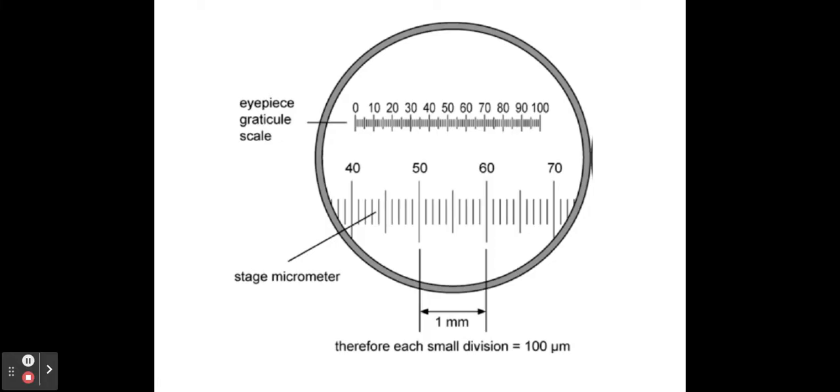Here I have my eyepiece graticule and my stage micrometer. You need to make sure that the eyepiece graticule, so this is the one that is in the eyepiece, the stage micrometer, this is the slide that you've put onto your stage. You've taken the specimen slide off, you put your stage micrometer on.